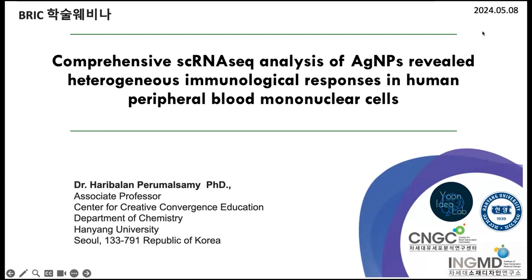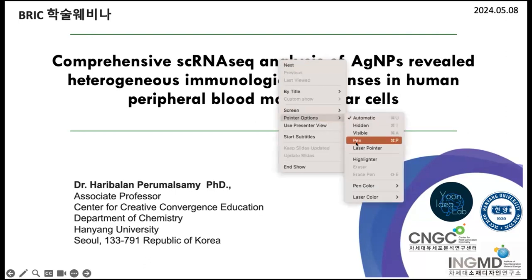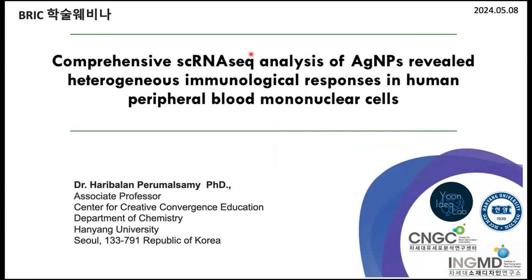Okay, thank you. So today I'm going to explain a highly advanced technology like single cell RNA sequencing. Single cell RNA sequencing analysis is a high dimensional advanced analysis, because until the last 5 years we mostly had bulk RNA sequencing analysis. That is more challenging with a heterogeneous immune environment, and I will explain in more detail. In a heterogeneous cell environment, we need highly advanced analysis. For example, we need to check cells one by one.